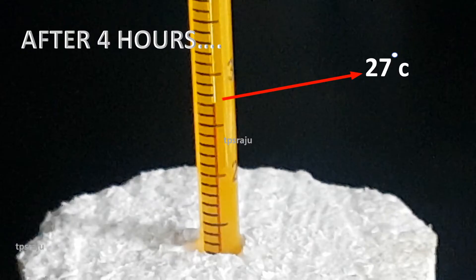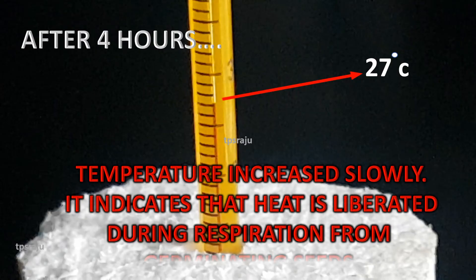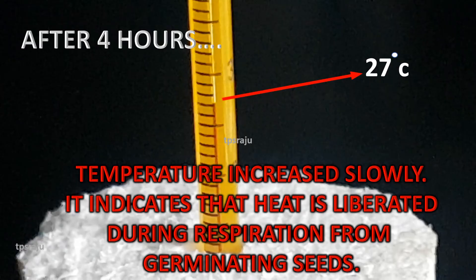We observed that the temperature increased slowly. From where is the heat produced? Heat is produced from the germinating seeds present in the thermos flask. Why does heat come from germinating seeds? Due to the respiration of germinating seeds. So, this experiment proved that heat is liberated during respiration.